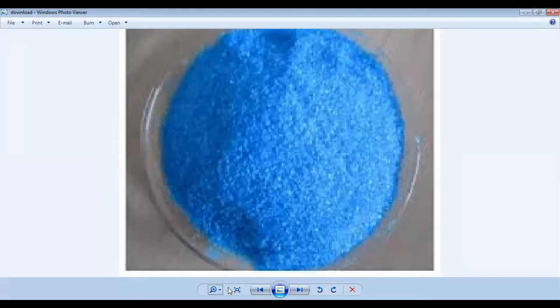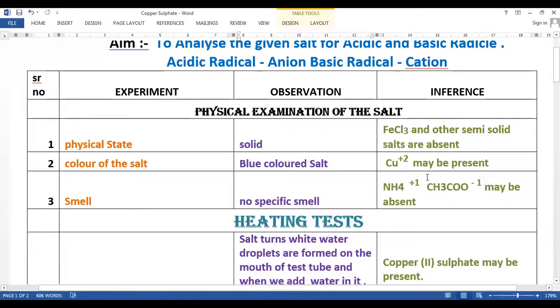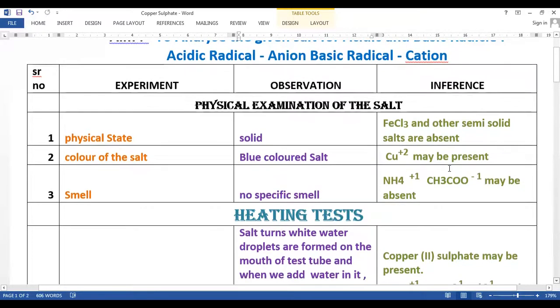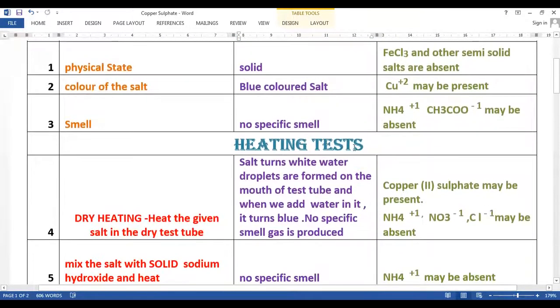So let us analyze the salt for the various tests. The physical state is solid, so FeCl₃ and other semi-solid salts are absent. The salt is blue coloured, so Cu²⁺ may be present. When we smell this salt, there is no specific smell, so NH₄⁺ ammonium ion or CH₃COO⁻ acetate ions may be absent.